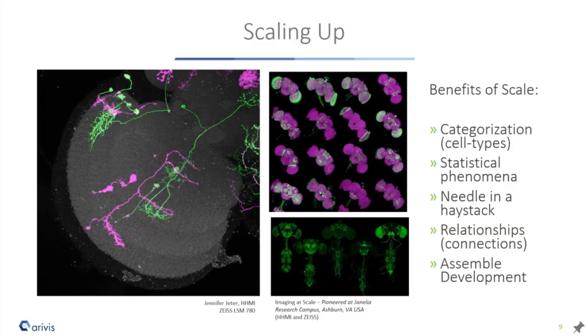And now we're bathed in all of these gorgeous images, and we need to extract the information from the images. And we're really set up in science now, and we have been for a little while, to really scale up our imaging and image analysis efforts. And by scaling up, some really special things happen. So one is, let's think about the case where we have a very high quality histology, really advanced cell targeting and imaging instrumentation.